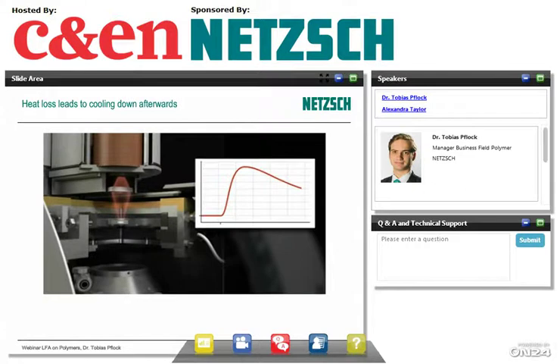And in the end, I will see the signal going down again due to heat losses to the surroundings when my heat was traveling through the sample. So this curve is characteristic for the kind of sample or for the kind of material that I scan in my laser flash apparatus.